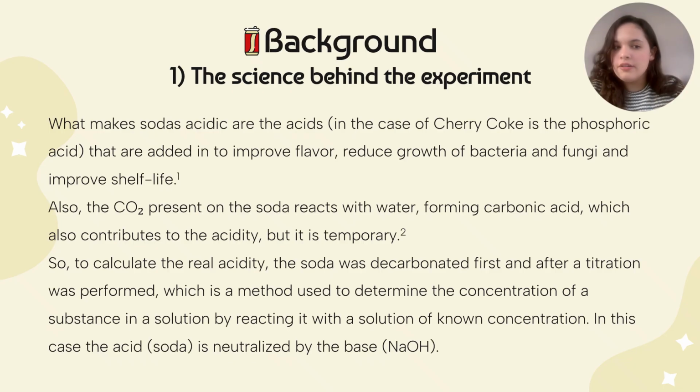And what is a titration? It's a method used to determine the concentration of a substance in a solution by reacting it with a solution of known concentration. In this experiment, the acid, that is the soda, is neutralized by the base, that is the sodium hydroxide, which is the solution of known concentration, because we know the molarity.